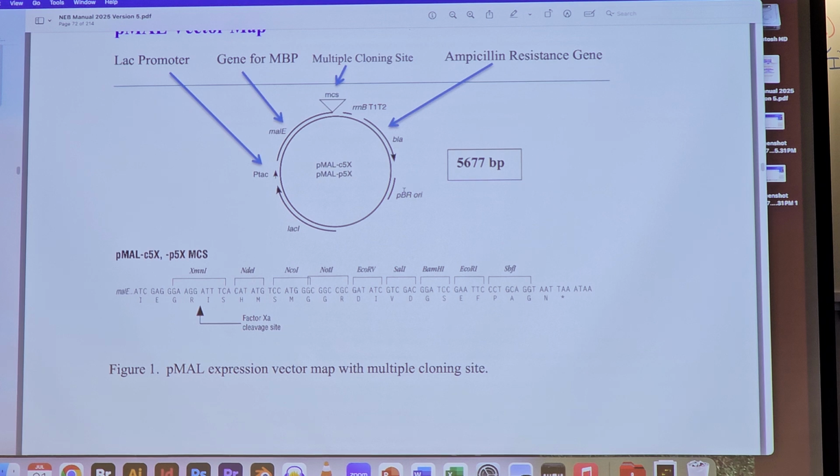This is our origin of replication here for working in E. coli. This is a plasmid origin of replication. It comes from a plasmid called pBR322. Not that you need to know that, but that's why it's called that. This is a high copy number plasmid, high copy number origin. And then the only other thing on this diagram I haven't explained is this, which is not relevant to us, and I even forget what that is, so don't worry about that either. If somebody's really interested, I can look it up, but I forget.